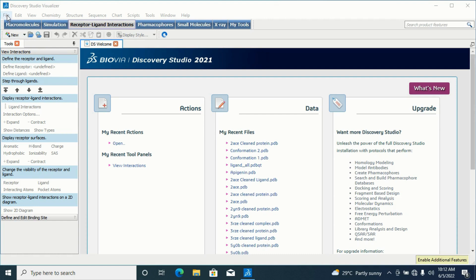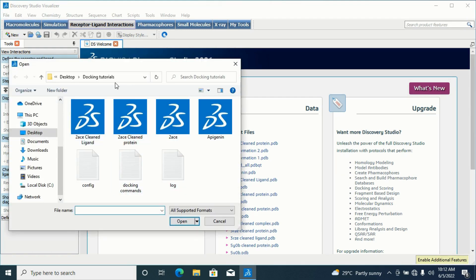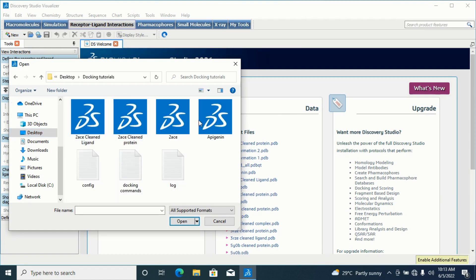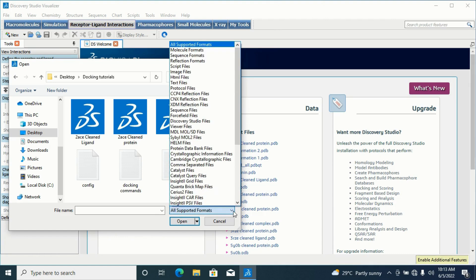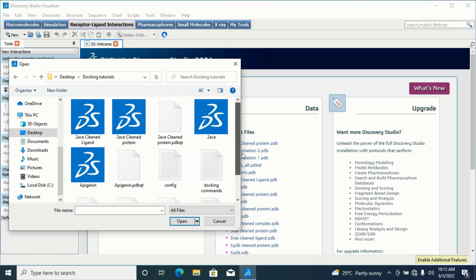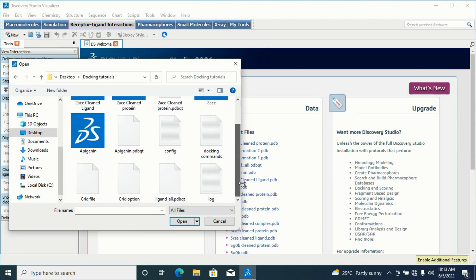I'll go to File, then Open, and it will take me to where my documents are. This is my document on the desktop. This is the folder where I have my results — all I have been working with and docked in a previous video. I'll simply open it. I'll go to 'All Supported Files' and set it to show all files so every file appears here. My result appeared in PDBQT format.